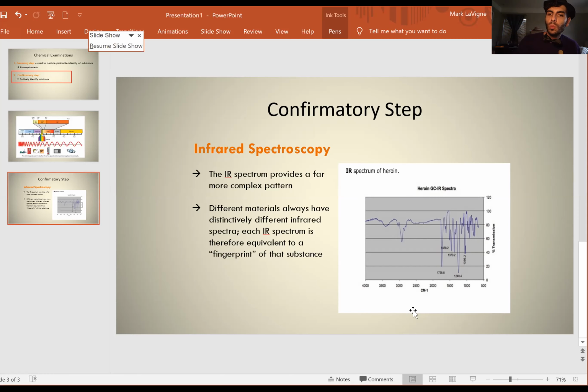It's called a spectra. And what is a spectra? It's just simply how the molecule is interacting with the IR radiation or the IR energy based on what chemical bonds are there. And you're like, oh my gosh, chemical bonds, what are you talking about? All that's really important is to say that different chemical bonds and different elements and how they're arranged on the molecule will affect how this spectra looks.